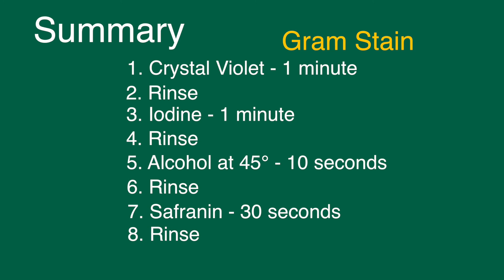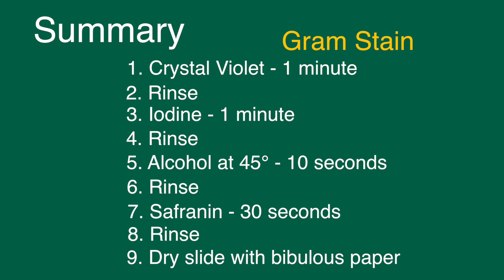After rinsing, place the slide in a bibulous paper booklet and gently tap on the book to dry the slide. Your slide is now ready to be examined under a microscope.